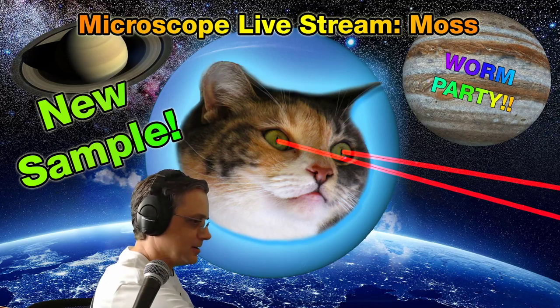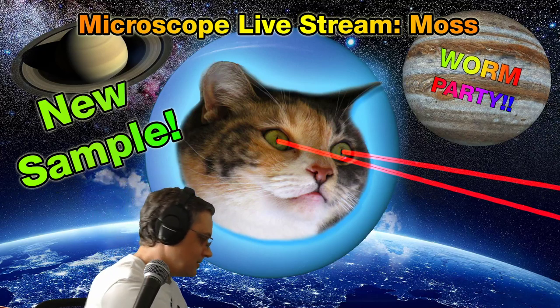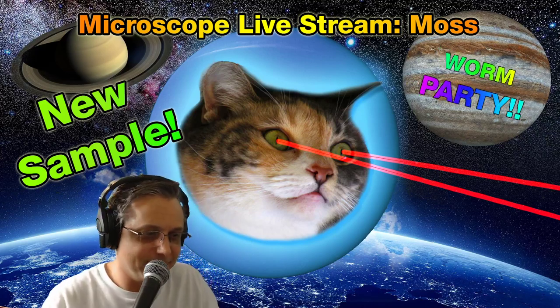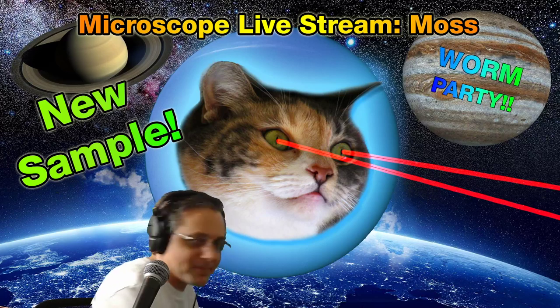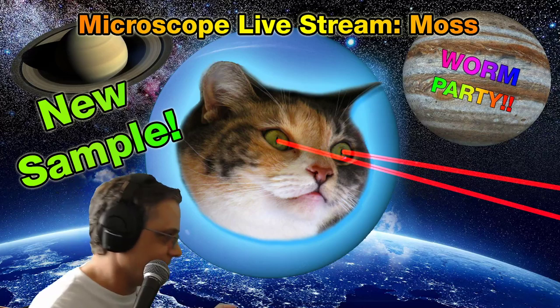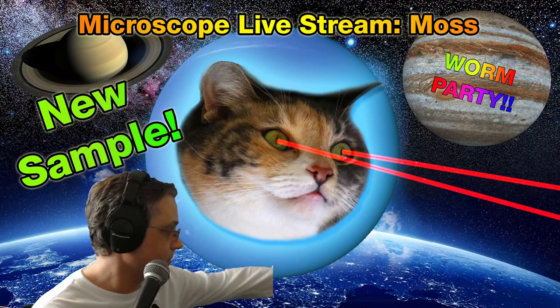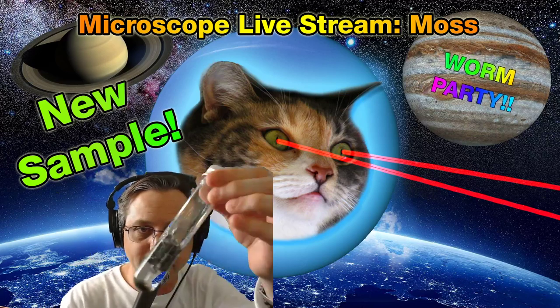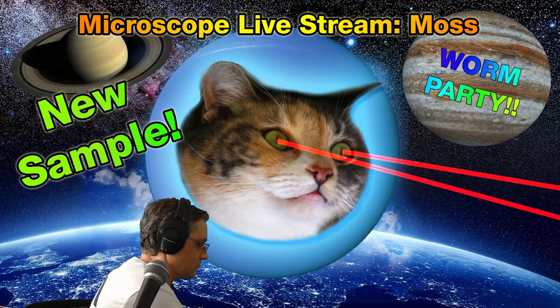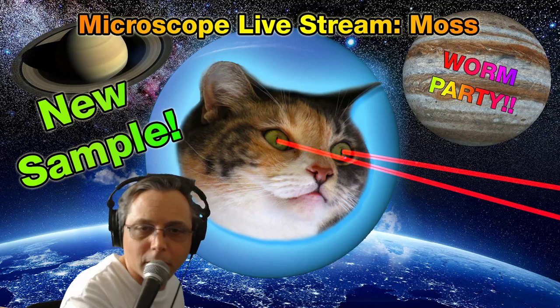So, I'm cleaning off this slide here. I should put on the music. So I want to go to another sample here on another slide. This is going to be the second batch of tree moss, second tree. Worm party.